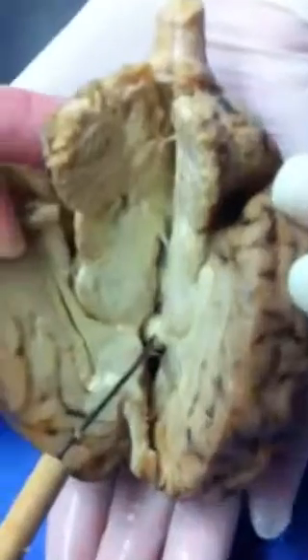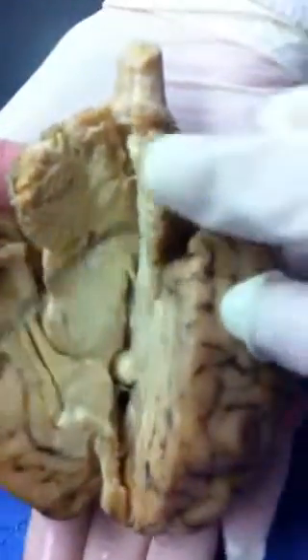This is the pituitary gland. This is the arbor vitae of the cerebellum. And then here, of course, is your spinal cord. This right here is the corpus callosum. And that is the portions of the sheep brain that we're going to show you today.